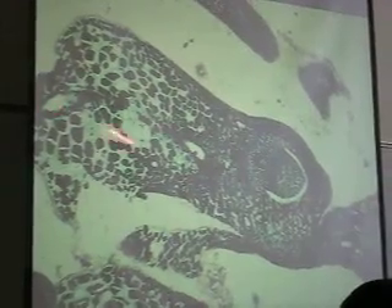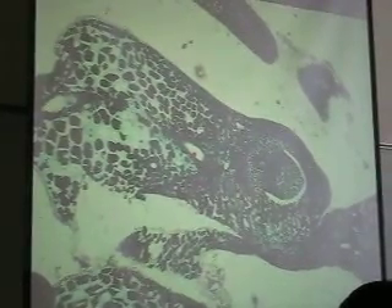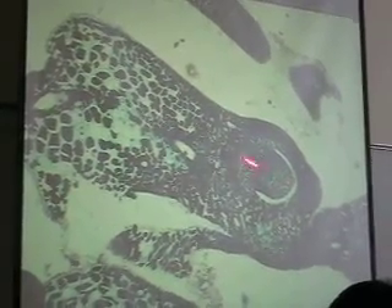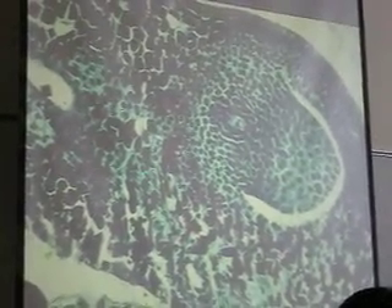Ovuliferous scale, bract, ovule — and inside, at 10x power, see how much bigger that cell is? That's the megasporocyte. That's what I want you to find: the megasporocyte. 10x power is fine. At 40x it's just bigger than the surrounding cells, but that's the megasporocyte.